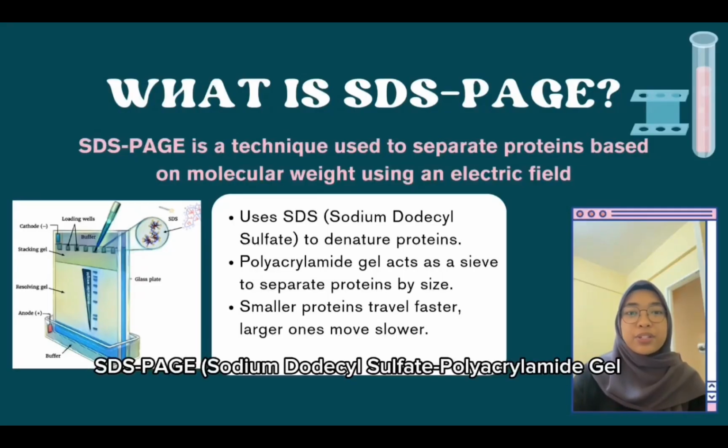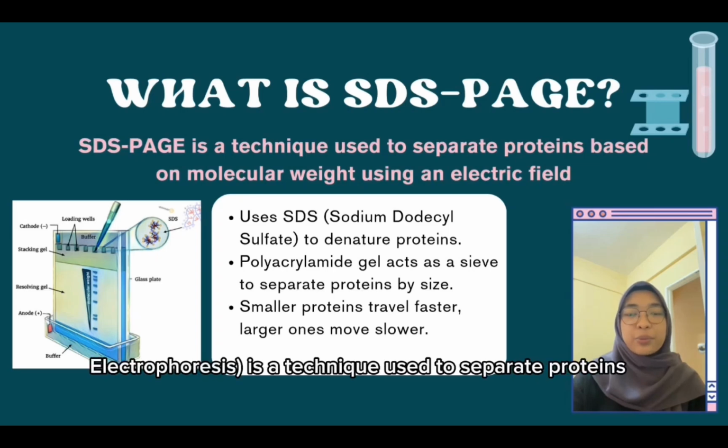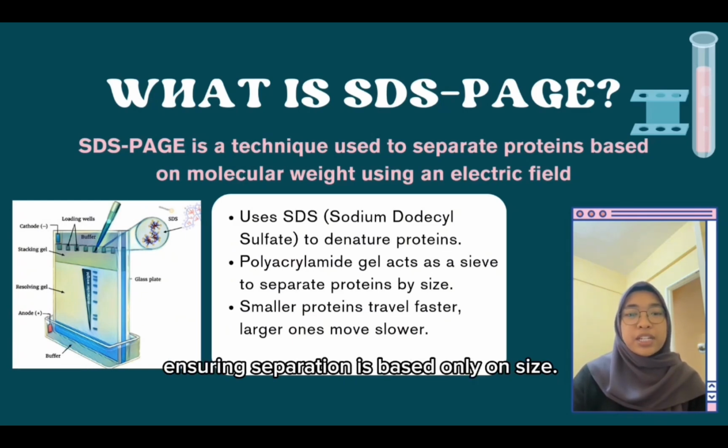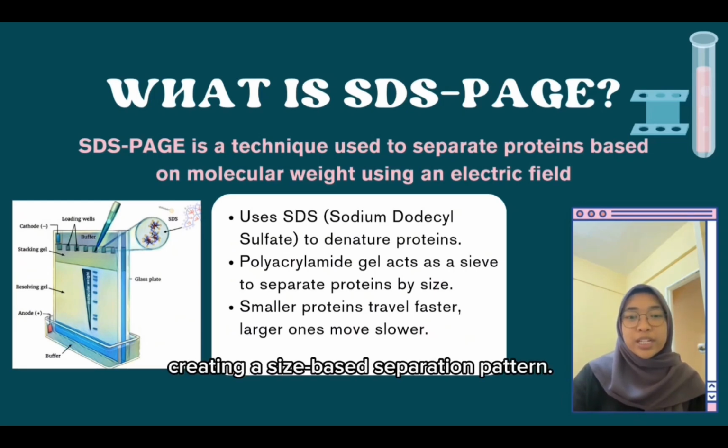SDS-PAGE, sodium dodecyl sulfate polyacrylamide gel electrophoresis, is a technique used to separate proteins based on their molecular weight. It involves denaturing proteins with SDS to eliminate structural differences, ensuring separation is based only on size. The proteins migrate through a polyacrylamide gel when an electric field is applied. Smaller proteins travel faster while larger ones move slower, creating a size-based separation pattern.